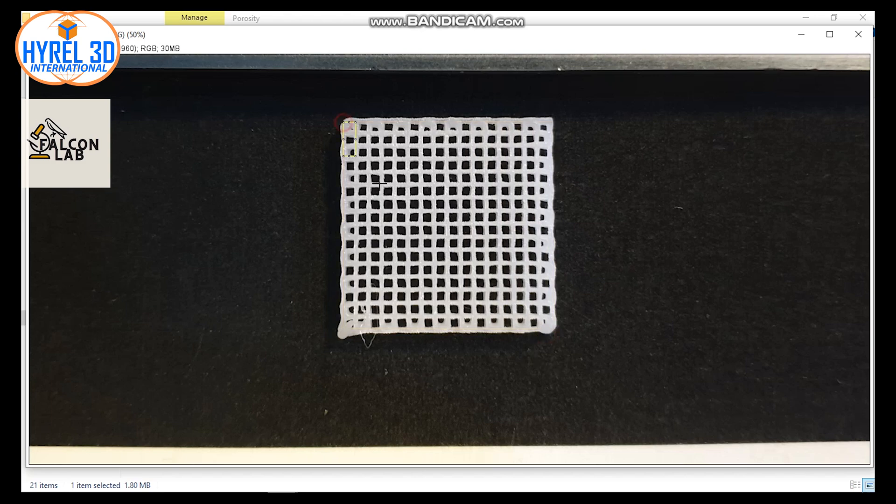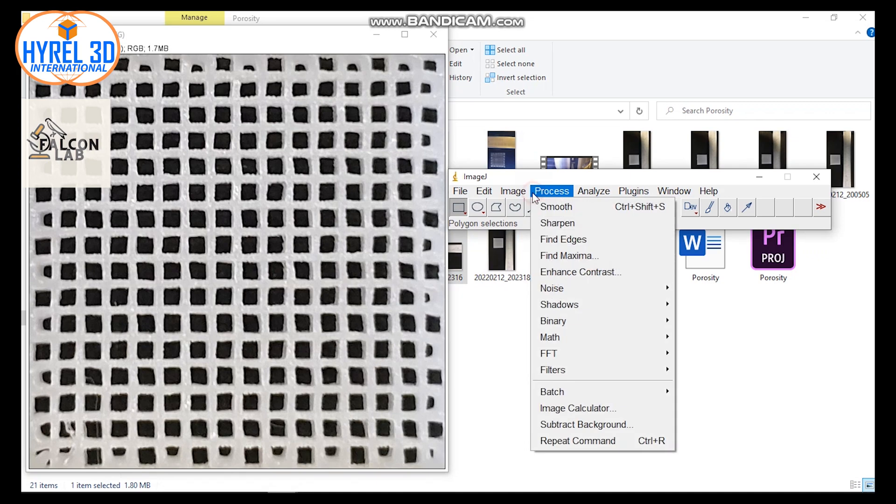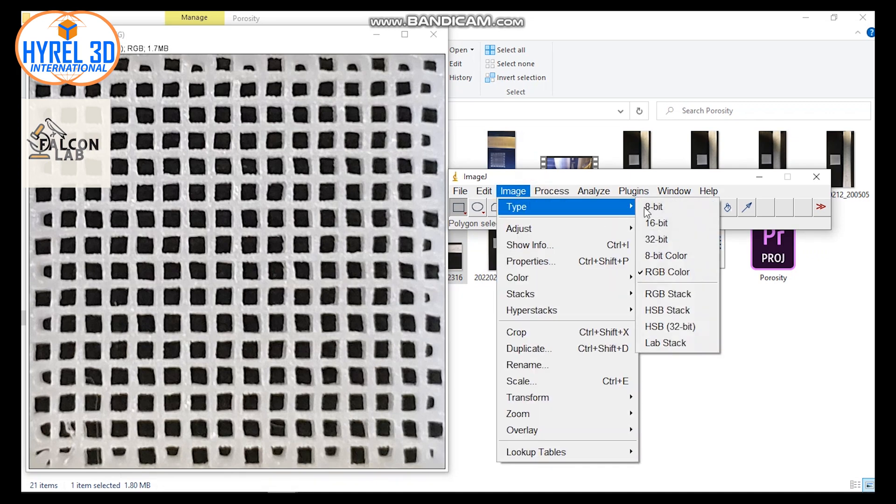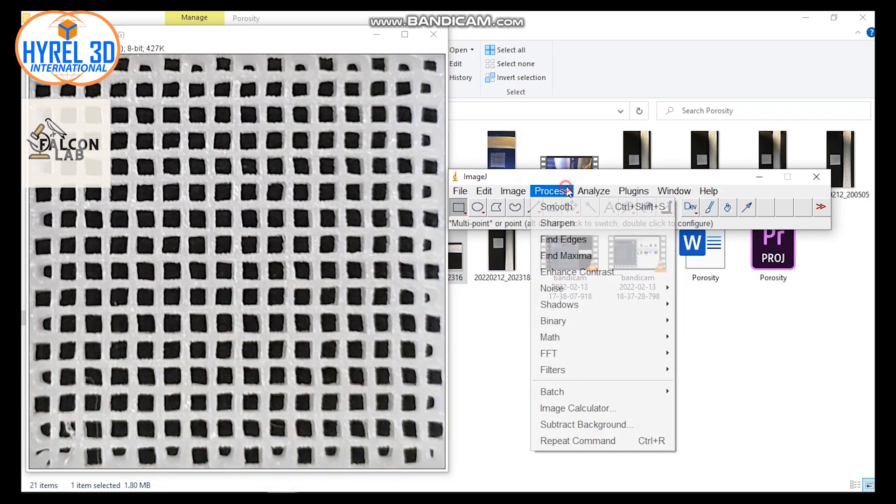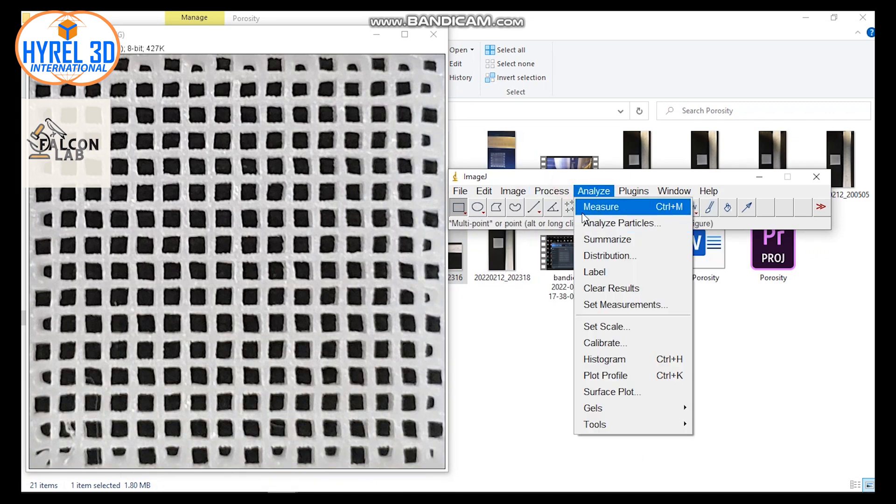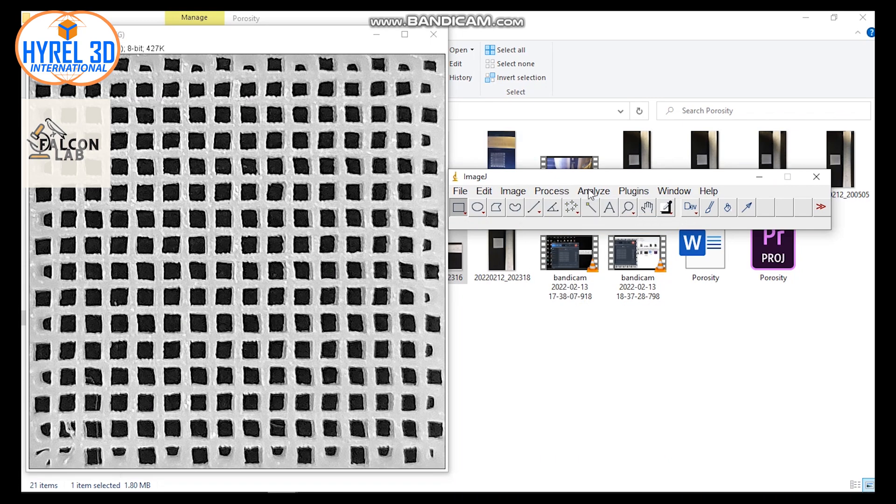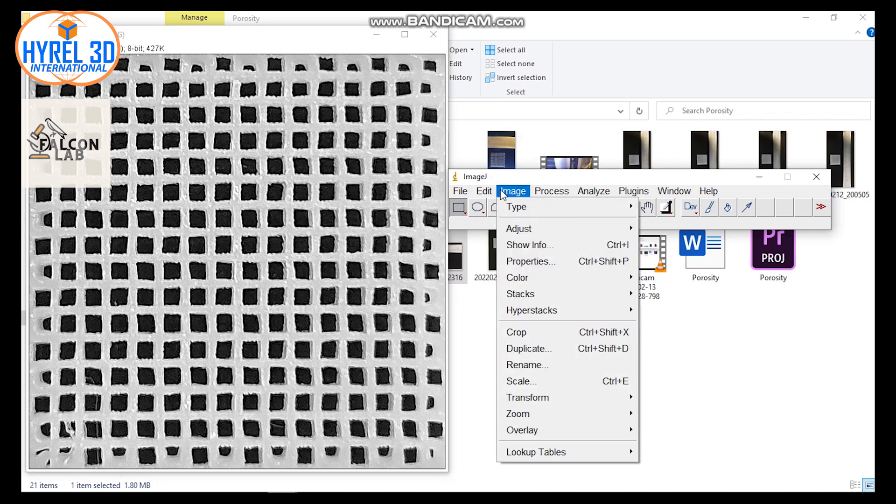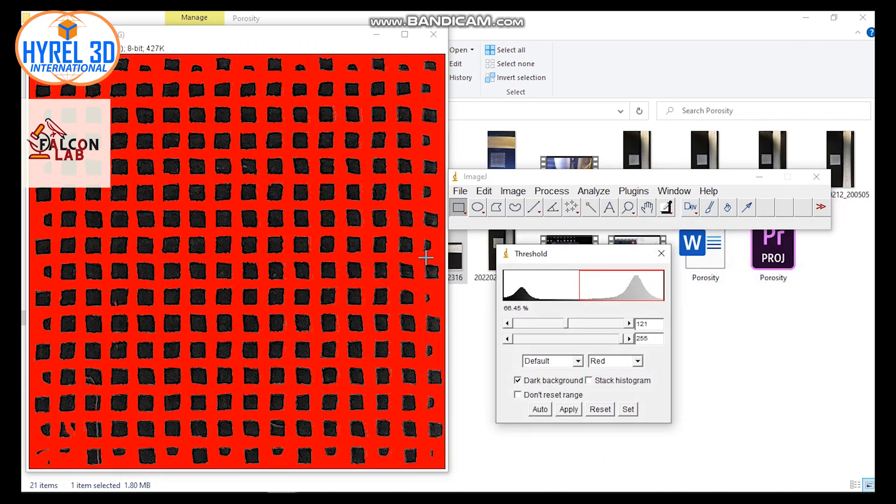Change your picture color to 8-bit. You can smooth or sharpen your picture by clicking on drops. Now let's go back to the Image tab, then Adjust, and choose Threshold. Now you will have the option to either calculate the strings of your scaffold or the pores.